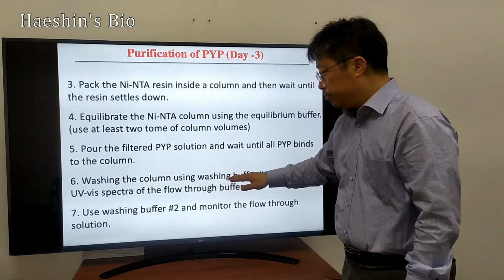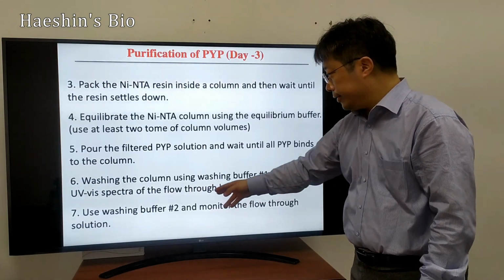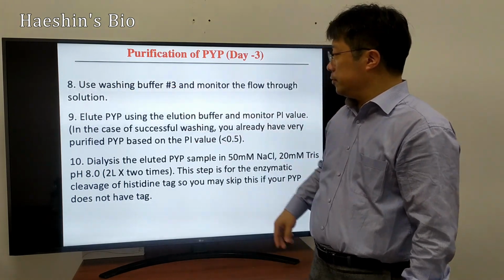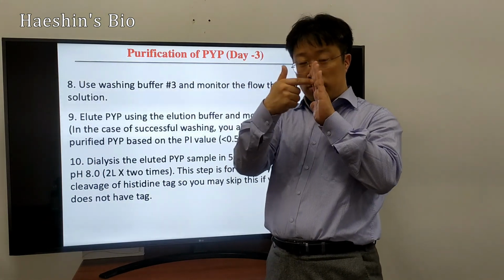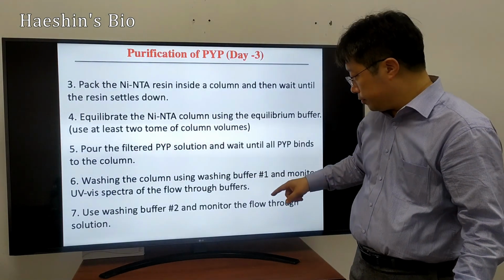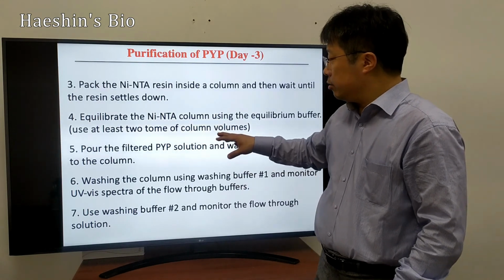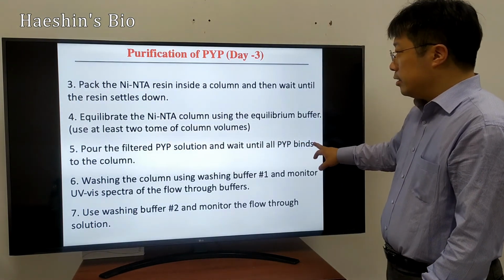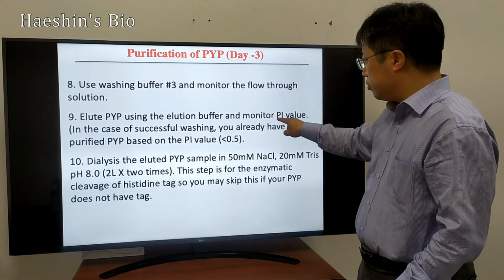So then we wash with the sodium chloride buffer that I explained here. So we wash with number 1 and number 2 solution, and then also number 3 solution. And then we assume that our target protein is still bound in the column resin. And then now we add the buffer solution containing 200 millimolar imidazole. Then we add this to the PYP-bound column, and then we elute this column, and monitor the PI, the purity index.